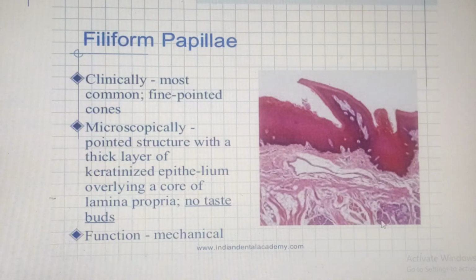So the last primary papilla that I talk about is the filiform papilla. Now, filiform papilla, the shape is conical in nature. These slender-like structures that you find are going to be keratinized. They will not be non-keratinized, they will be keratinized. So they will have stratified squamous keratinized epithelium, and because they are keratinized, we don't have any taste buds in the epithelial lining. That is why they have this mechanical role, creating friction as we chew food in the mouth.